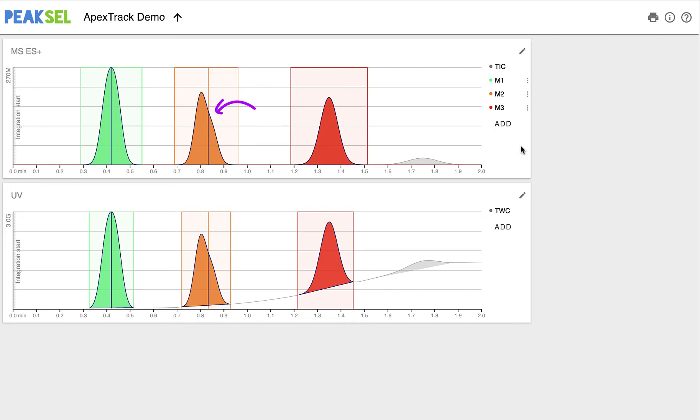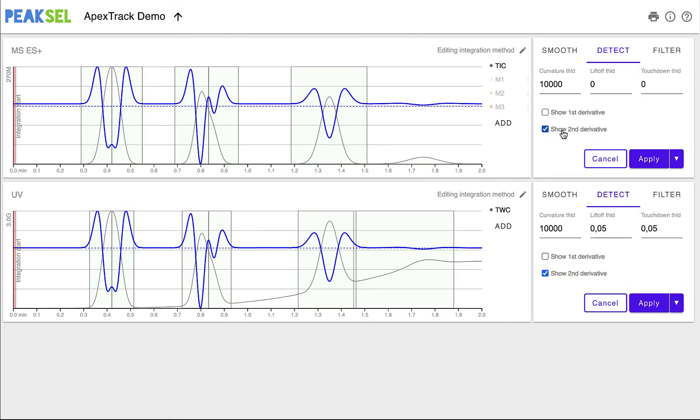But look at shoulders and round peaks. They don't have local maxima. And that's where the second derivative shines. It improves the resolution of peaks. The shoulder is now completely resolved, as you can see. Round peaks may not be well resolved, but at least they have apices. That's a start.